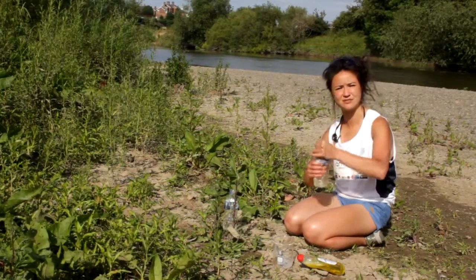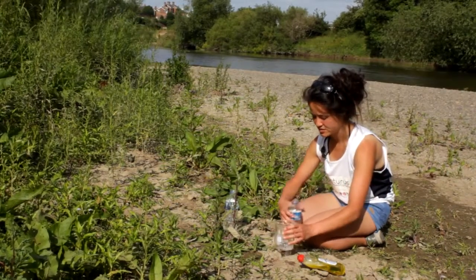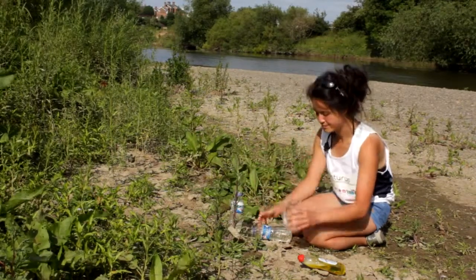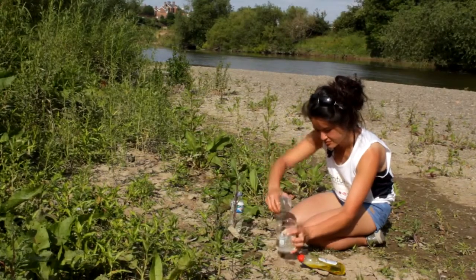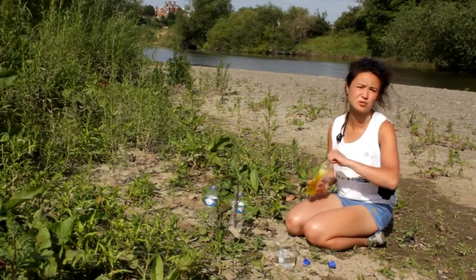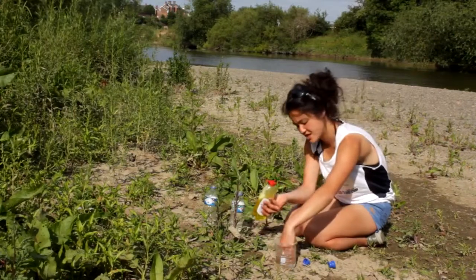So I'm going to take my second water source. This is 60 miles from the source of the Severn. I'm going to pop it in here. Just rinse this out. And again measure the same amount. And again measure how much soap it takes to form a permanent layer. That's 3.